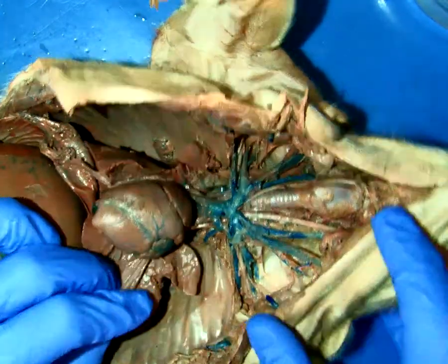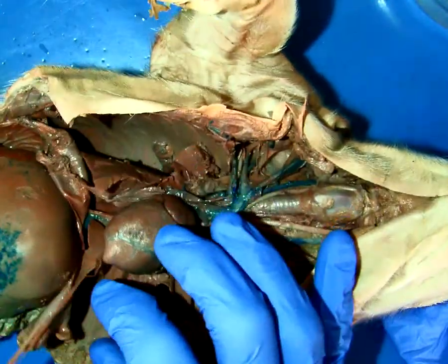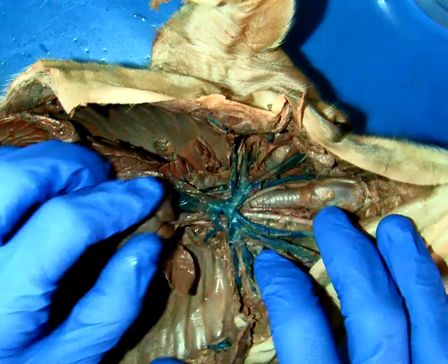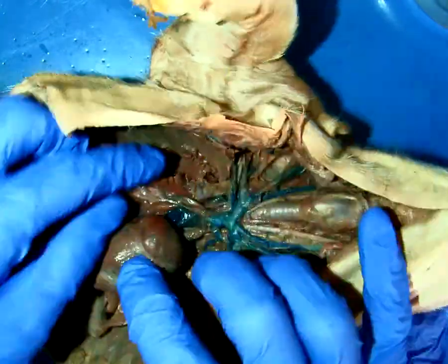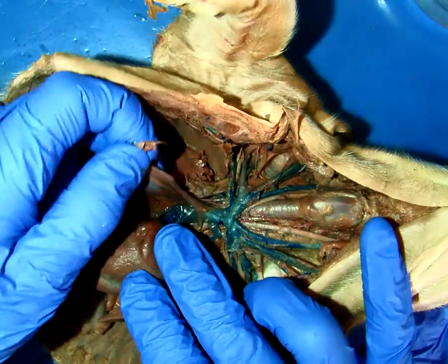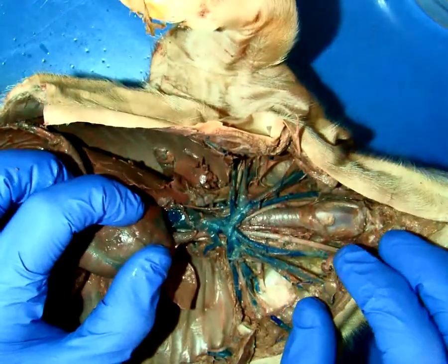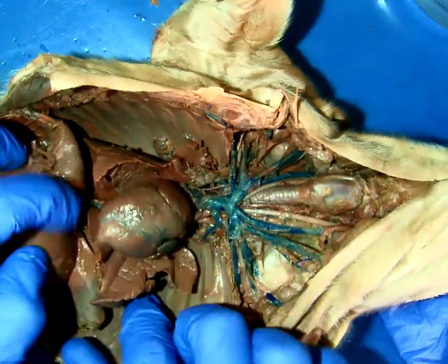All right? And then we'll quickly run you through. Just pull this connective tissue out. Okay? And I think I'll take some still photos of this as well, because this is a really good pig. And just pull out some of the connective tissue that's, again, in our way. And we'll go beneath the diaphragm now.